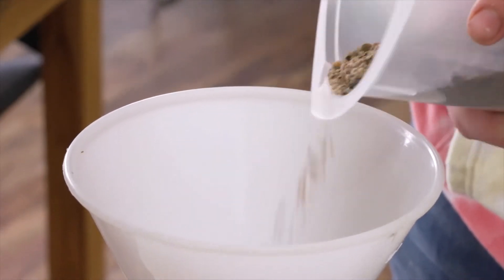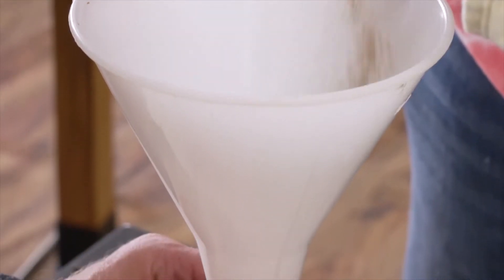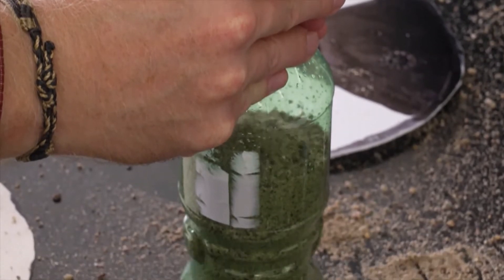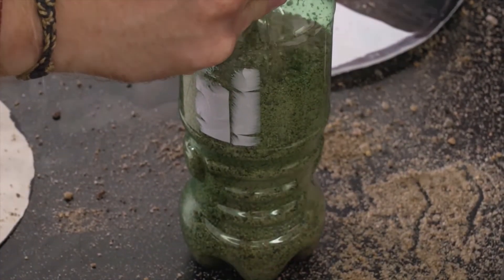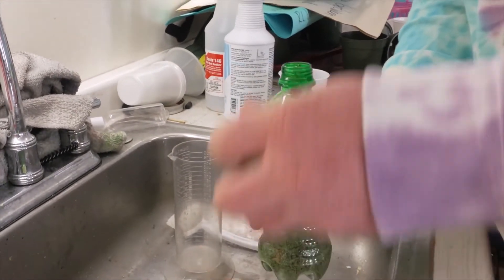Step 4: Fill your bottle with sand. The bottle will be used as a weight to stabilize the disc and help it sink. It doesn't need to be filled all the way to the top, but you should try to get it better than half full of sand. Once you have a good amount of sand in your bottle, fill it to the top with water and seal it tightly.